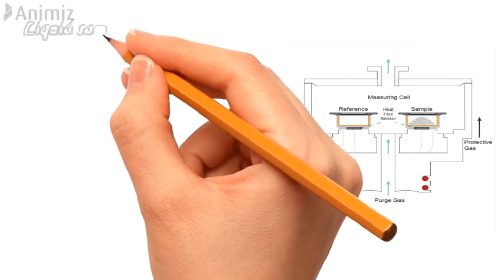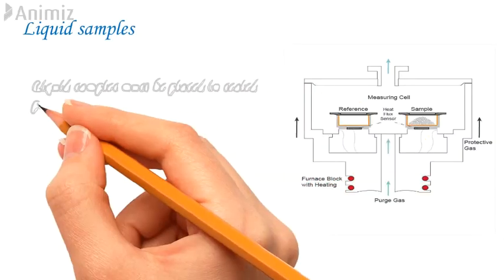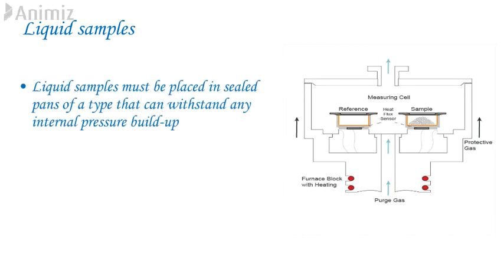7. Liquid Samples. Liquid samples must be placed in a sealed pan of a type that can withstand any internal pressure build-up. Do not overfill the pan or contaminate the sealing surface which will prevent sealing and cause surface leakage. When sealing a liquid, bring the die together gently to avoid splashing the sample.